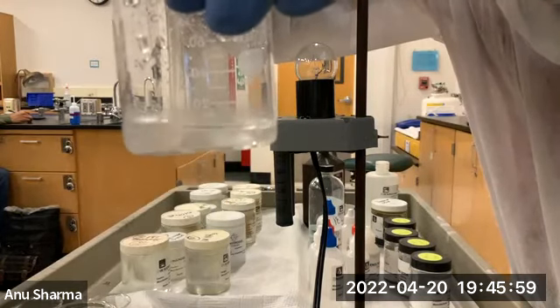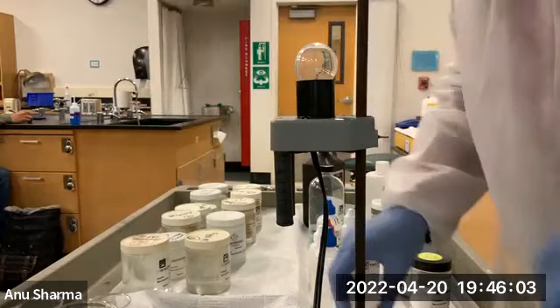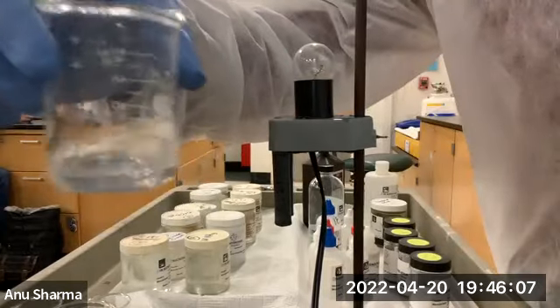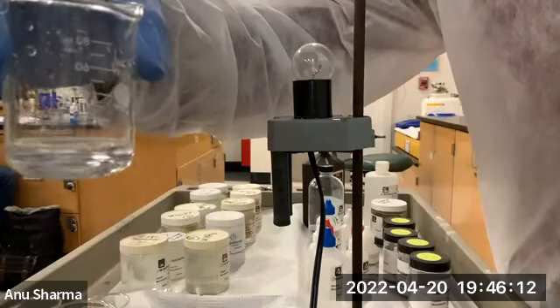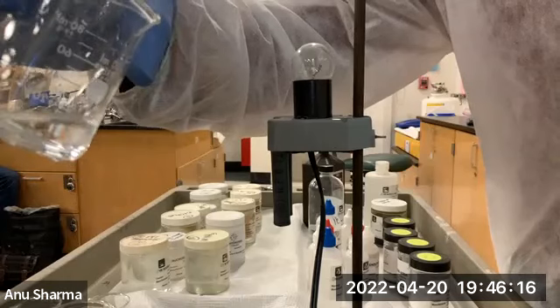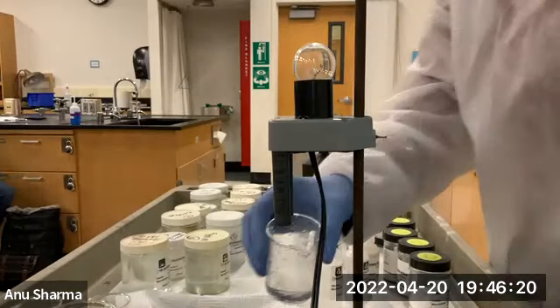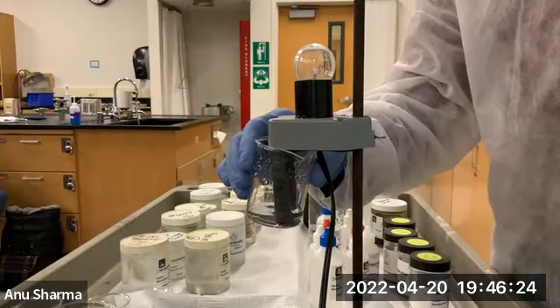As I'm pouring, it shows bubbling, but that settles down. That's the initial hydrogen bonding occurring. And so now we still have a clean solution. So it's soluble in water because of hydrogen bonding, but a non-conductor of electricity. The bulb is not lighting up, okay?